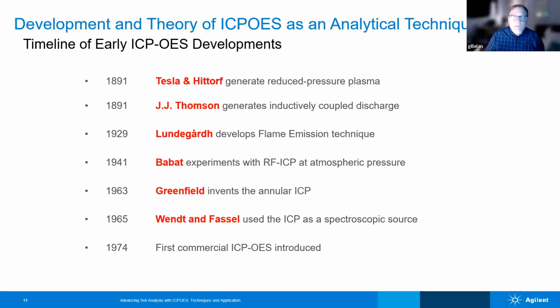The first commercial ICP-OES came out in 1974, so it is not an old technique. It's not a very old technique, but it is something that has really matured in the last 15 years and become kind of an indispensable tool in elemental analysis.